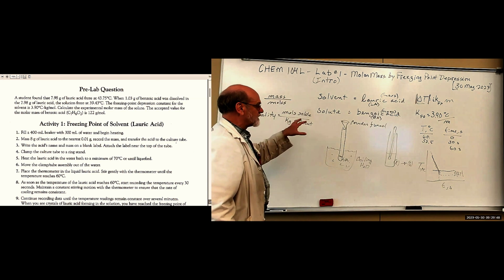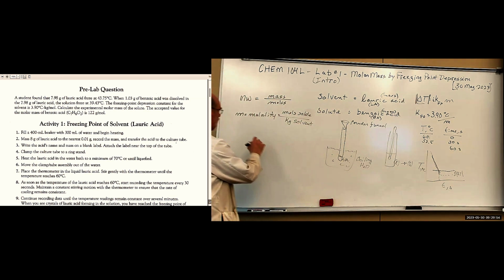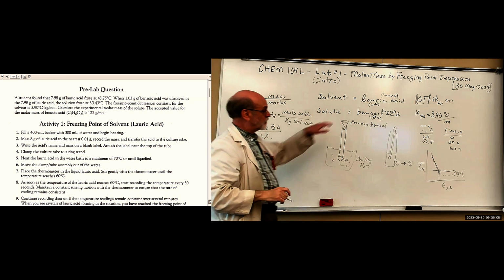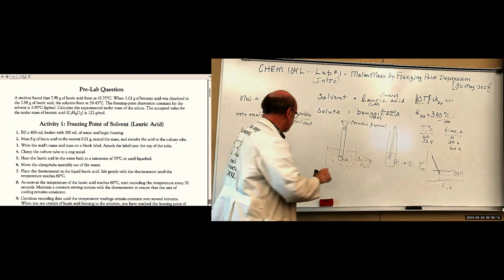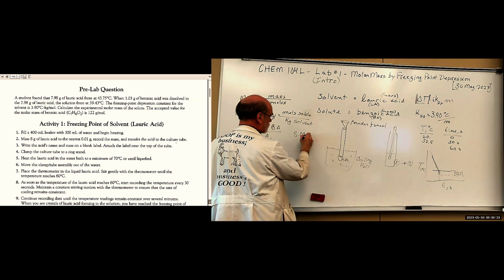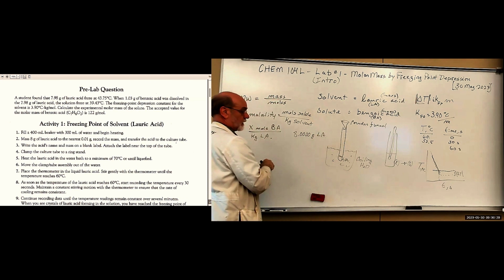And then we have this value, and we can calculate molality, right? We can calculate the molality of this solute in that solid. And once you have the molality, it says you have so many moles of benzoic acid per kilogram of lauric acid. Okay. So if we're measuring this in grams, let's say it was around 8 grams, wasn't it? So you have 8 grams. Actually, you probably get more decimals than that. You can get 4 decimals. Grams of lauric acid.